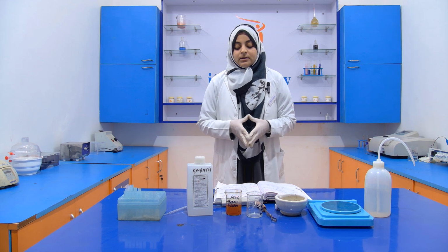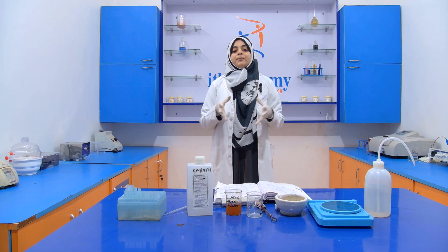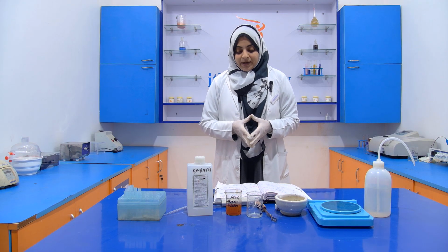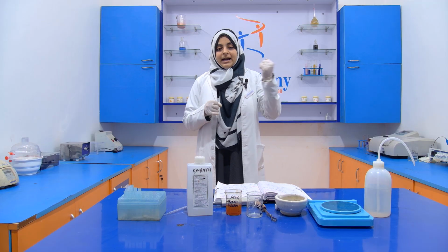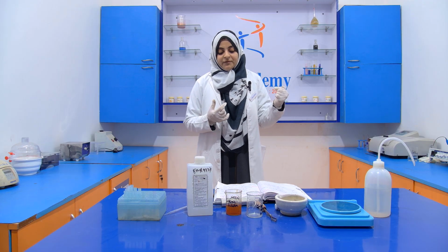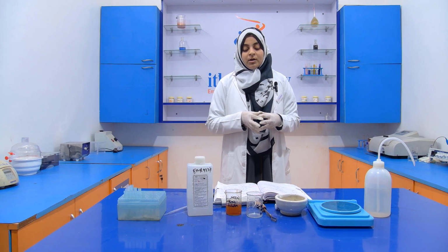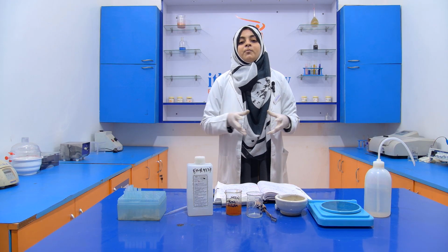When the potassium iodide is completely dissolved, then we add 0.2 gram of iodine, and when both are dissolved, we make up the volume to 100 ml.